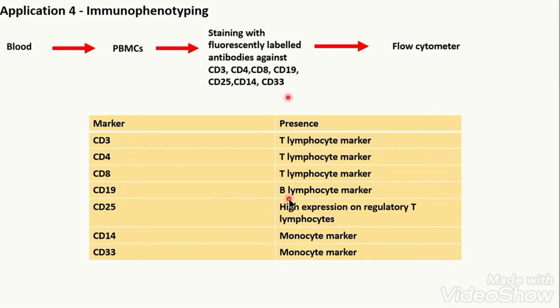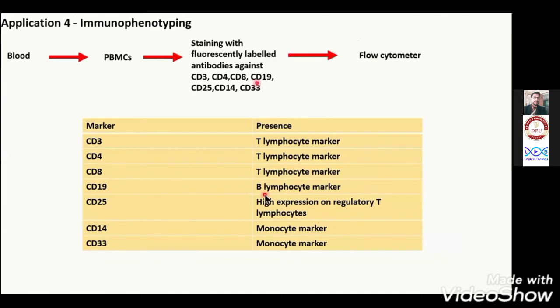If somebody asks, can you explain helper T cell, TH17? Then I say, yes, they are CD4 positive, CD8 negative, they are positive for IL-17, they are positive for ROR gamma T. So that is the definition. Things are moving more and more based on protein-based characterization of the cells.